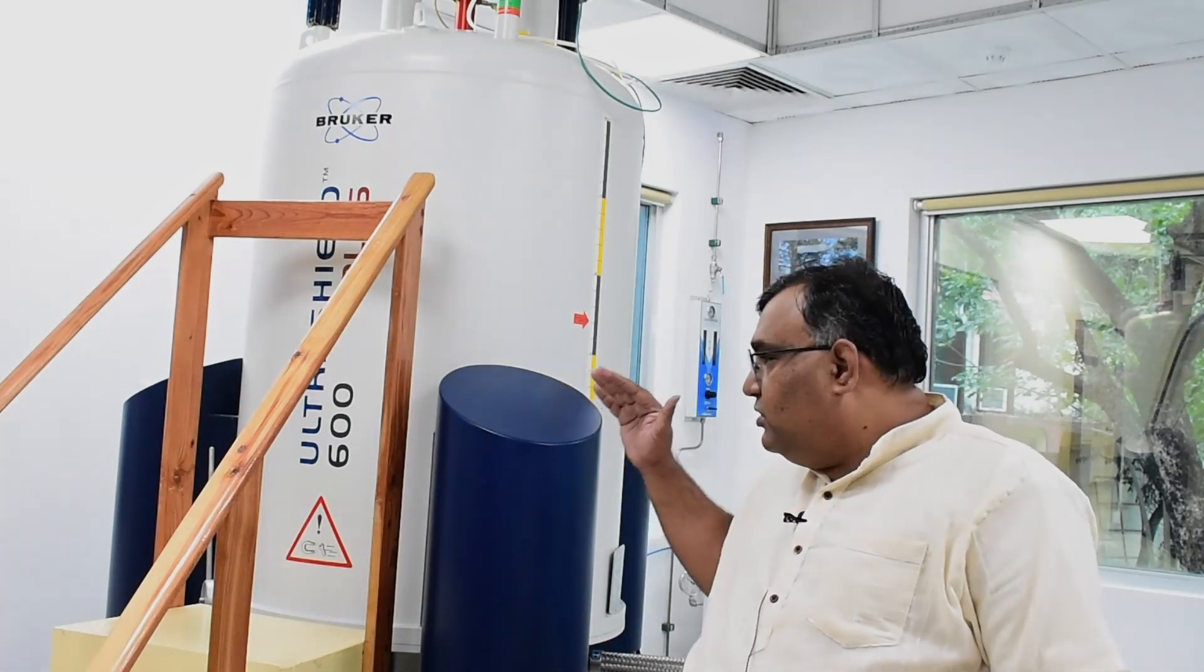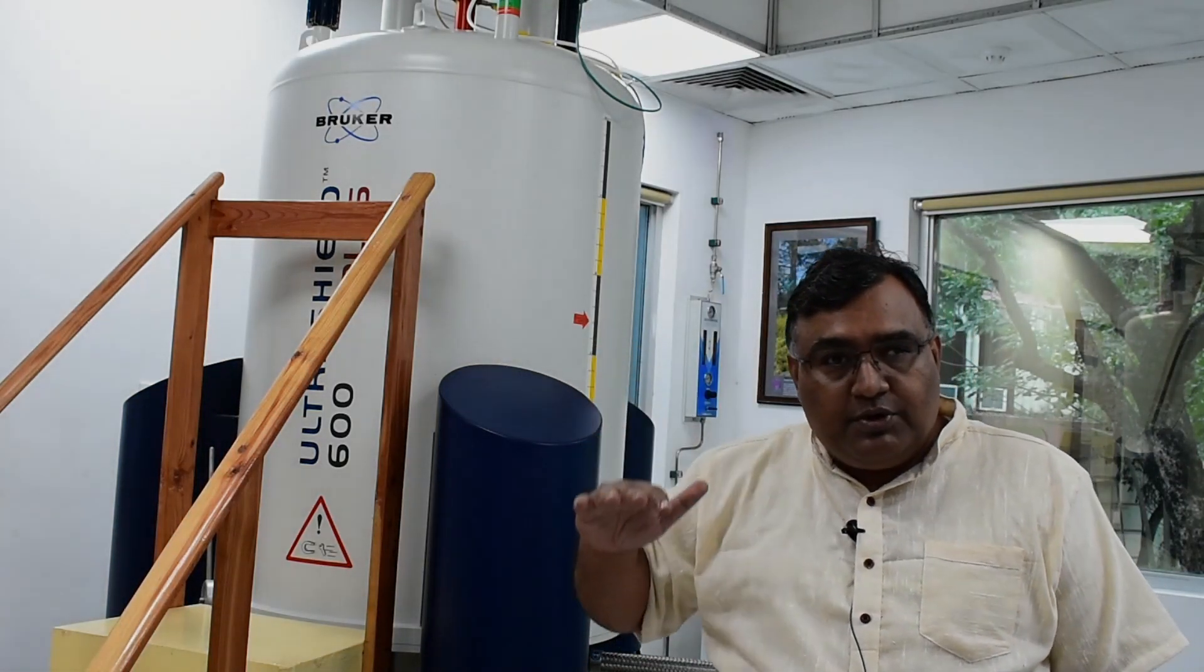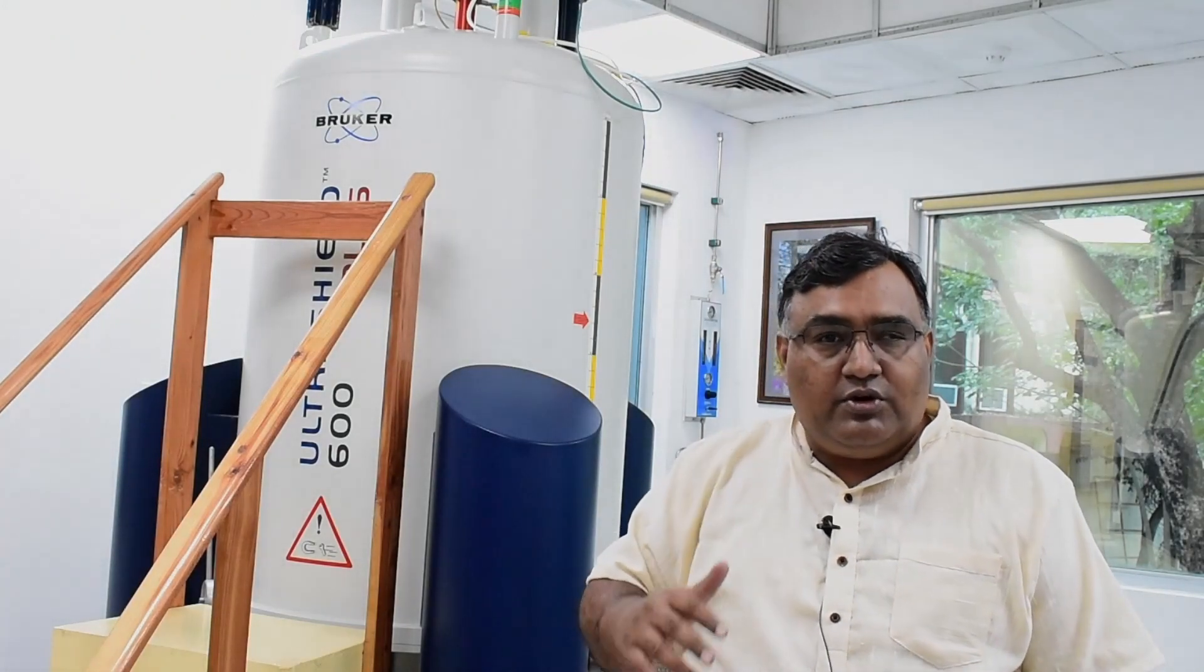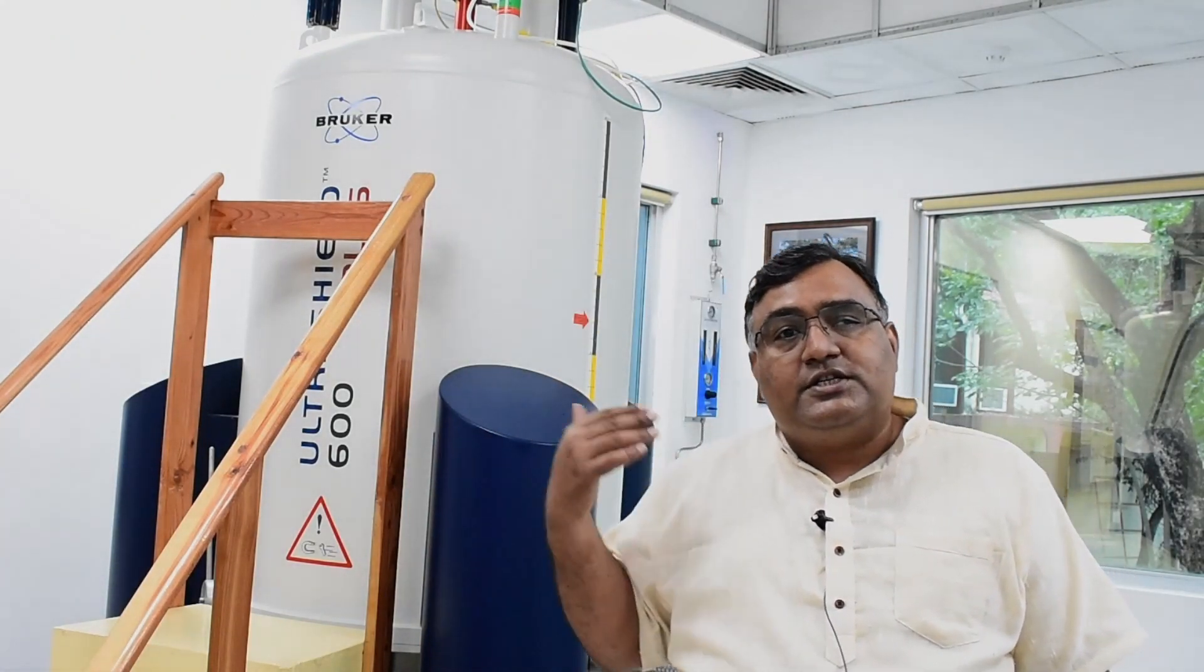Now anything at 4 Kelvin and room temperature is say 20 degrees Celsius which is 293 Kelvin, effectively you have a huge gradient and there are losses due to radiation. And these losses due to radiation have to be dampened because helium is a rare commodity.